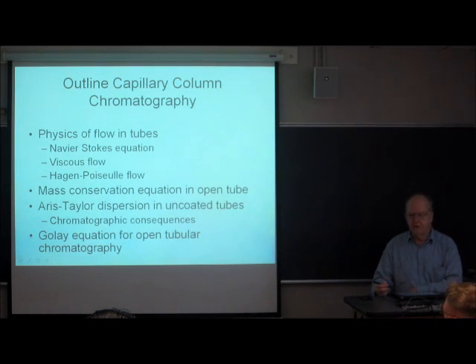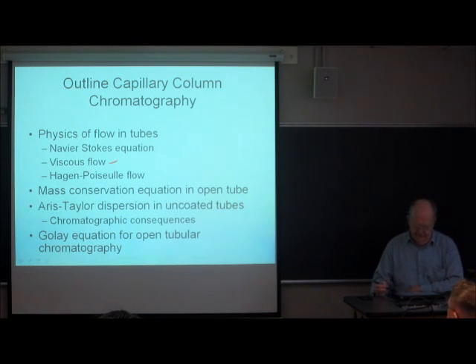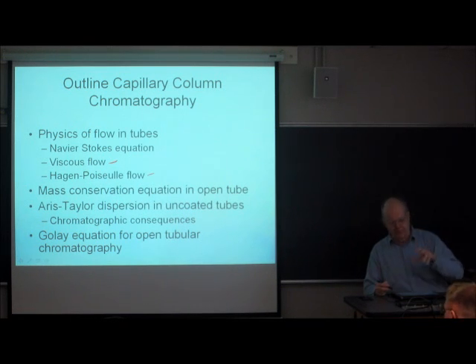And the Navier-Stokes equation is nothing more than Newton's second law of motion applied to a fluid. So we're going to talk about viscous flow, and in particular, one particular solution to the problem of viscous flow is what's known as the Hagen-Poiseuille flow equation. This is the fundamental equation of fluids in capillaries.